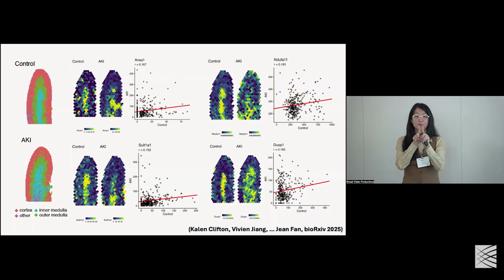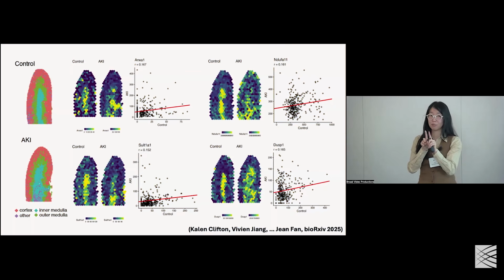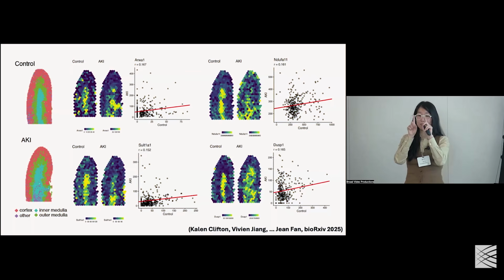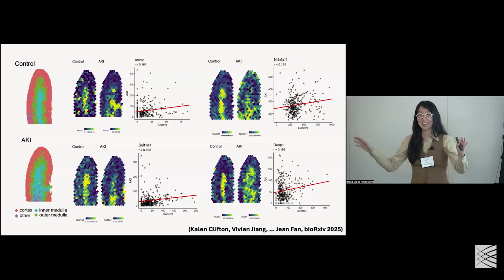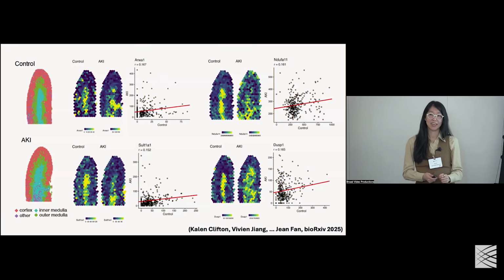So if we rasterize at a resolution that's smaller than our alignment resolution, these will end up being pixels that are next to each other and not overlapping. But if we use a rasterization resolution that's bigger than the limits of our alignment resolution, then we're essentially smoothing that over. So if there is a case where there's some kind of repetitive structure where I want to smooth that out a little bit, I would choose a rasterization resolution that's bigger than that.